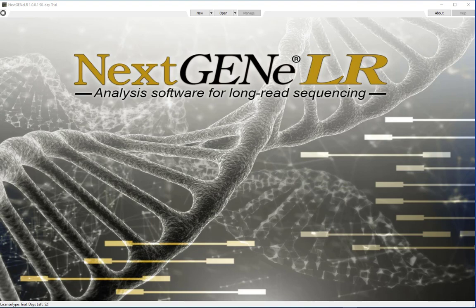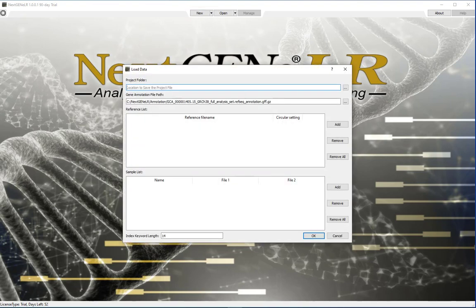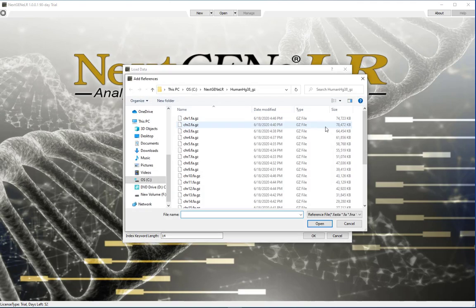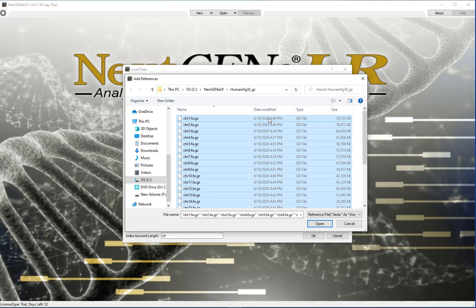Now we can go on to set up a new analysis. Click New. Under Reference List, click Add. This will open a dialog showing the directory set as the default reference directory. You can load multiple reference files in FASTA format. Click to select your reference files — you can select multiple files when applicable for your data. Click Open to load the files.